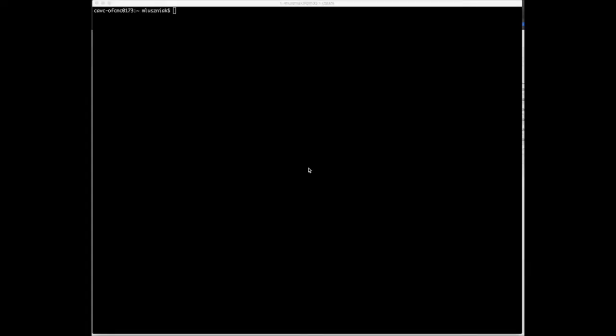So let's actually take a look at the config slicer tool. There's a number of places where you can run this tool, but you should know that each Clarity server has a copy of the tool. So for convenience, I'm going to log into the source system and run the tool there and do the export. How you connect to the system may vary.